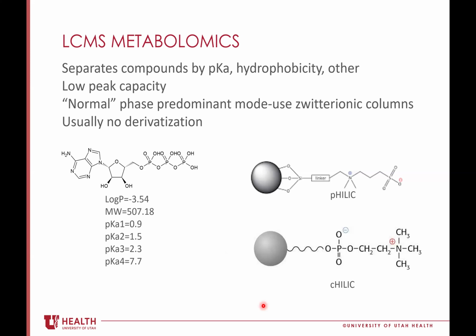So yeah, and then also compartment specific markers, that could be more like if there's an organ specific or cell type specific disease process going on. We do that for mitochondria for sure. There are certainly patterns that we observe for dysfunctional mitochondria. Usually it's TCA cycle intermediates or a shift to fatty acid oxidation. And so that's one of the ones we'll use. And there's a couple others.